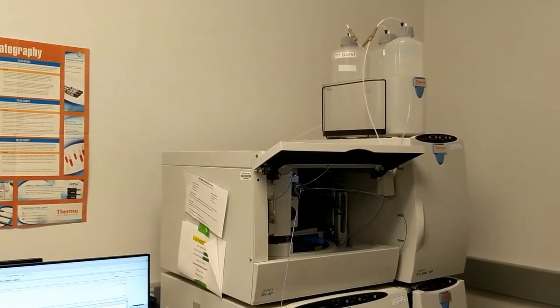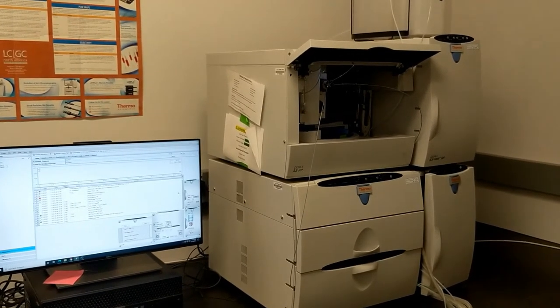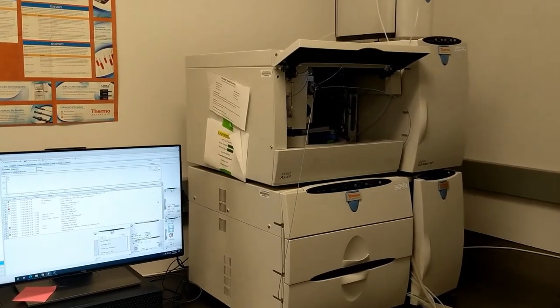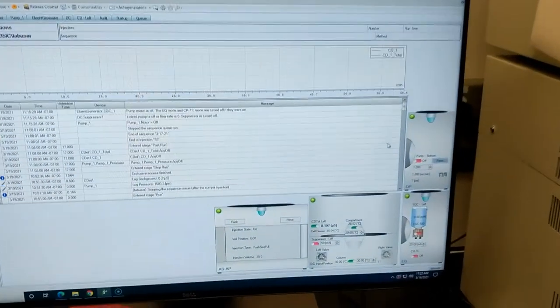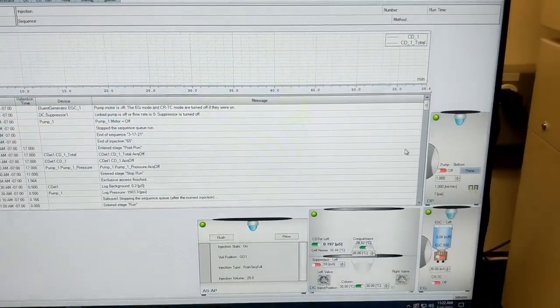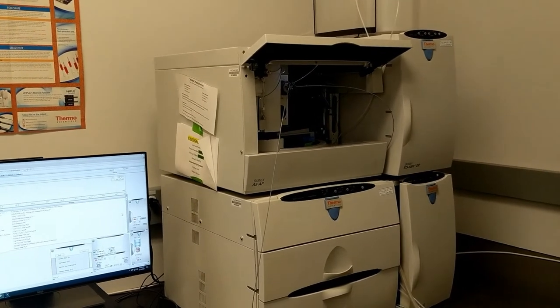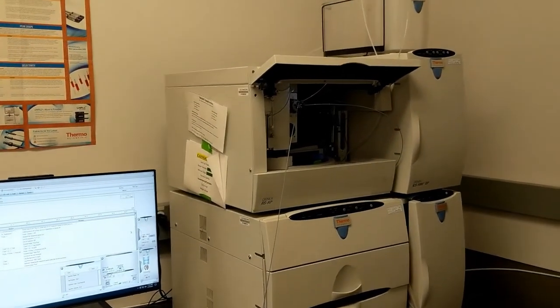Now that the bottles are filled, the next thing we need to do is prime the pumps. This means getting the system full of liquid and making sure there are no air bubbles — because air is bad for the system — before we start the run. You'll only need to do this when the pumps are off. If you can see it's red in the software, it means the pump is off. Normally, if someone is running the IC correctly, the pumps won't go off — they'll be kept in a low-flow idle mode.